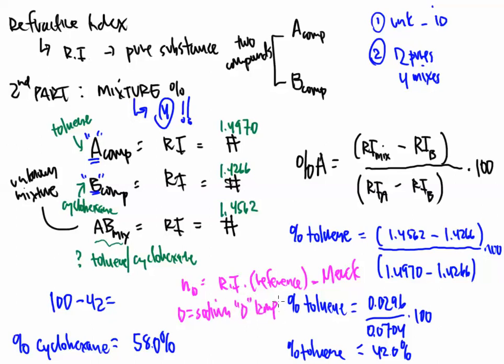It's very important that we give this sample only 1 nanometer of light, one specific nanometer of light to shine into. And this light is from a sodium D lamp. So this takes out a variable of the equation for us. We have a light source that we're calling the lamp. That lamp is only providing 1 nanometer of a specific wavelength of light.